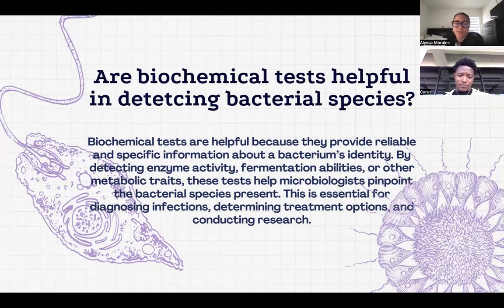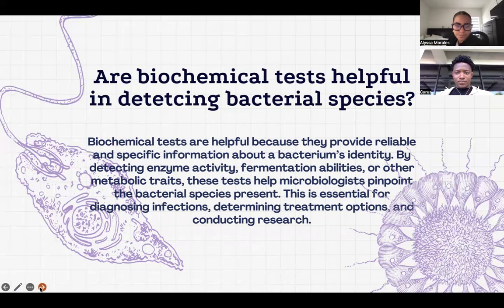By detecting specific enzyme activities, fermentation abilities, or other metabolic traits, these tests help microbiologists pinpoint a specific species present. This is what we were attempting to do in our class, and as you'll see at the end of this presentation, we successfully did. Ultimately, in the grand scheme, this is essential for diagnosing infections, determining treatment options, and conducting research.